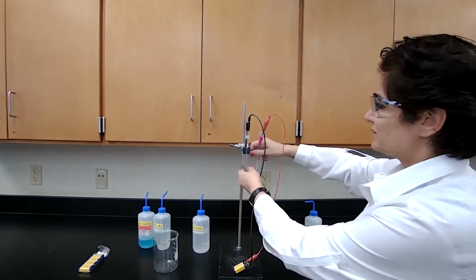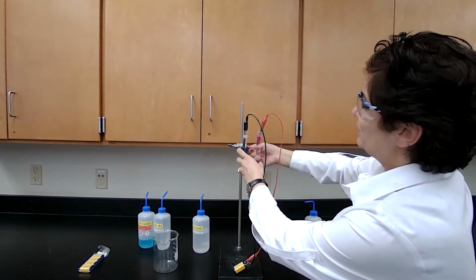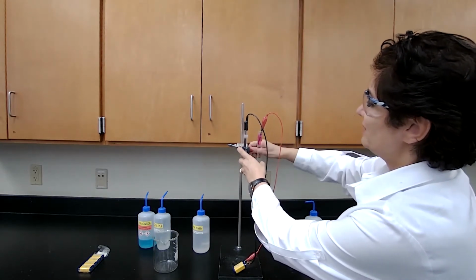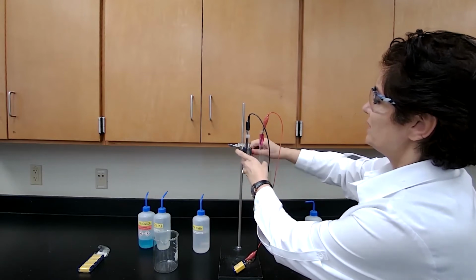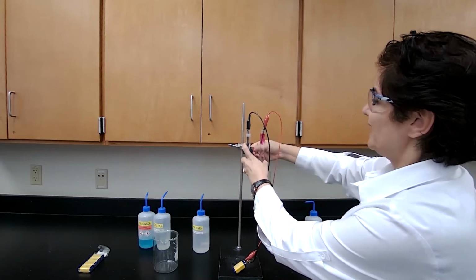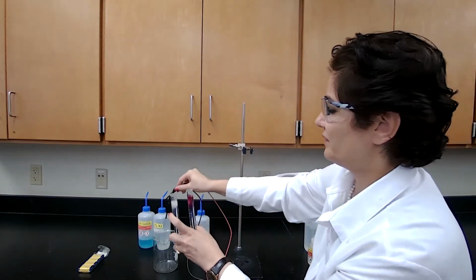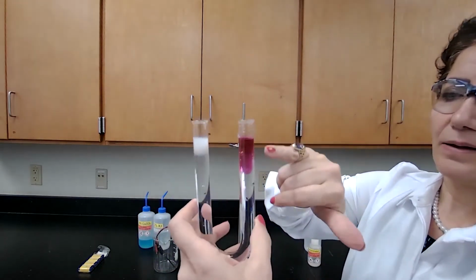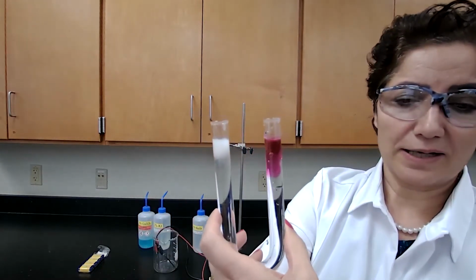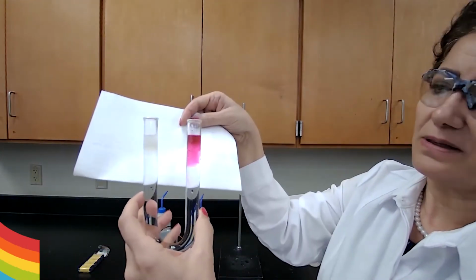I'm going to bring this closer, and in case there is a color change, we could see it at the same time together. I don't have to keep the electrodes in anymore. We're done with this part of the experiment. Now, the red color, thank you. The red color is obvious.